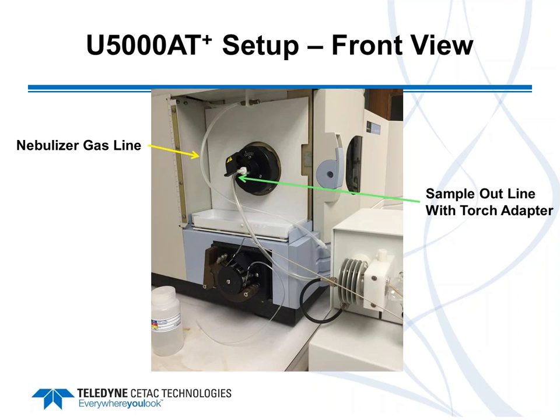In the experiment, we will use the host ICP-AES peristaltic pump. And you see the USN is now on a laboratory cart moved off the bench, so it's in close proximity to that. Of course, samples, you can connect the sample uptake line to an autosampler if you wish, or if you have a limited number of samples, you can run them manually.